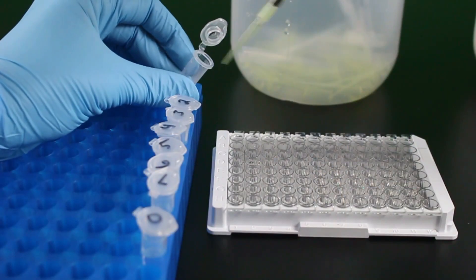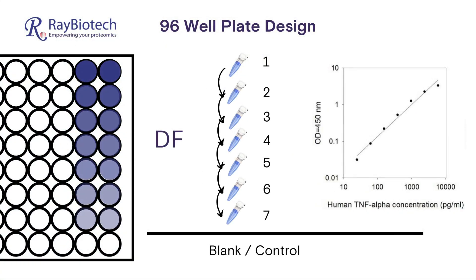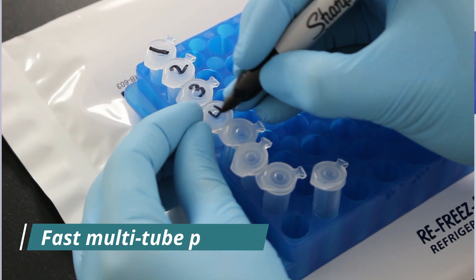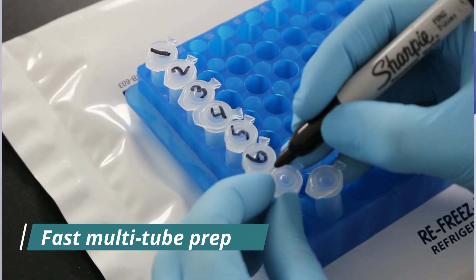When performing experiments with 96-well plates, most of the time the number that people use to fit the plate is seven dilutions and one undiluted sample or control that people use as a blank. This provides seven measurements throughout the desired range of detection while keeping a metric for the amount of signal that the background produces in the absence of any targets. By doing a serial dilution and using the same dilution fold in each step, we save time preparing separate dilutions while covering a wide and even range of concentrations.